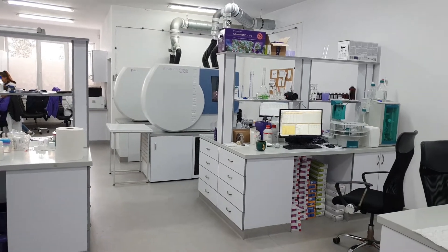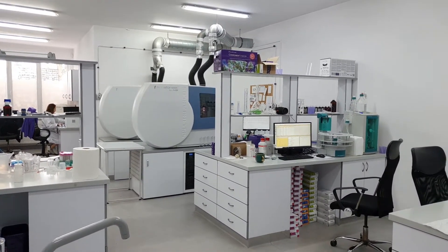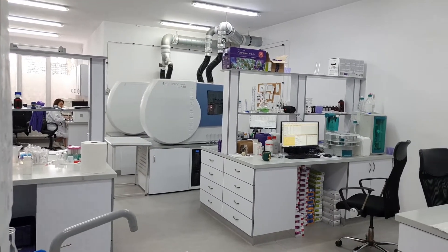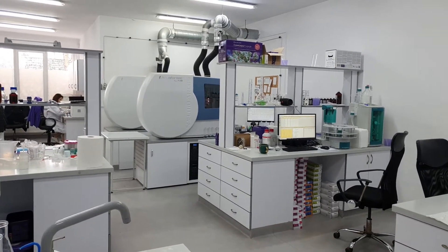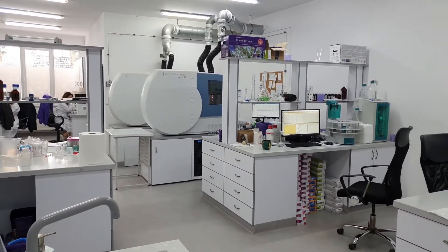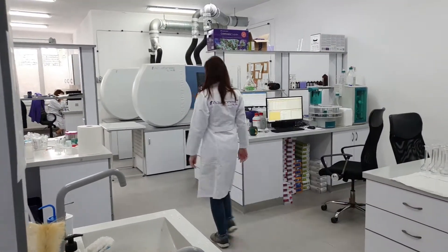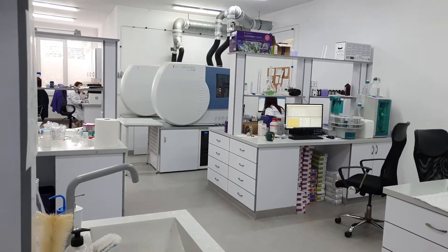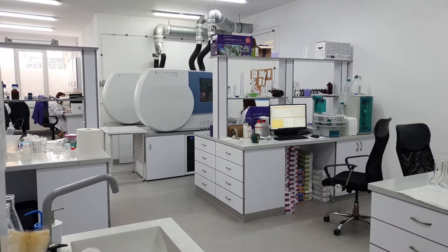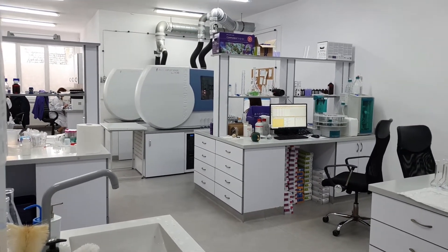We have two ICP machines, which are known as the best on the market — most accurate, most reliable. We also have a chromatograph, which is more for our quality control, not for outside service. Why do we have two machines? Of course we can make more tests, but at the same time these ICP machines have limits. They should be calibrated for trace elements and macro elements separately. So if we want good, accurate readings, we make macro element tests on one machine and trace element tests on the other. If we had only one machine, as in the past, we would need to recalibrate it every day. Now one machine is dedicated to traces and the other to macro elements.